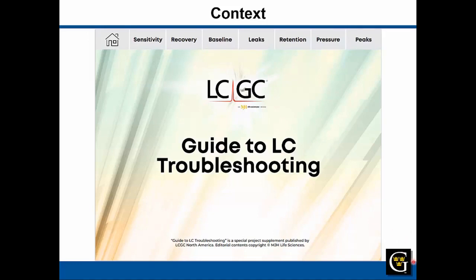And earlier, I guess a couple of years ago, in thinking about some new articles to write for LC troubleshooting, I was thinking that there are just some topics in LC troubleshooting that are really timeless, that no matter how much the instrumentation improves over time, and it certainly has improved tremendously over the past decades, we still have some problems that keep coming up over and over again. And a lot of these problems are reflected in the wall chart.